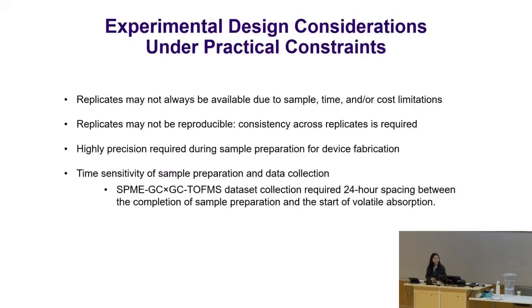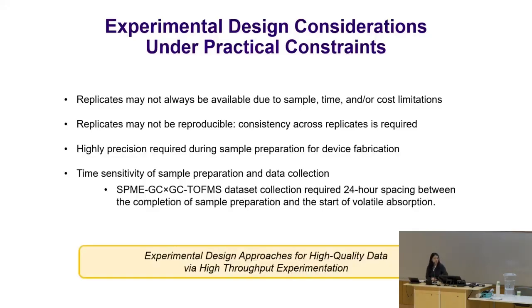Under our practical constraints, we have limited samples, a high reproducibility requirement, and sometimes a high precision demand for our device fabrication. For this SPME data set, we have a time-sensitive requirement too. So we need to choose the right experimental design approach in order to collect high-quality data more efficiently.